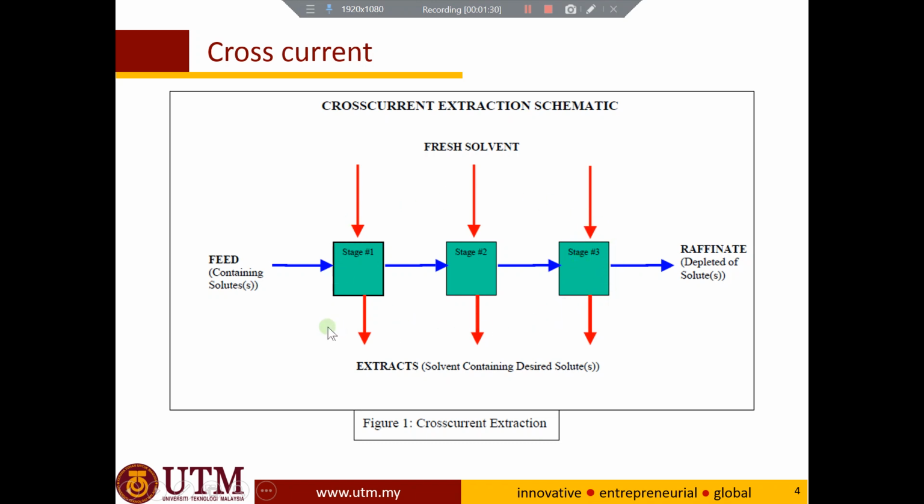And then what happens is the amount of extraction solvent will be increasing because you always add fresh solvent. Okay, so dia akan bertambah sebab you asyik tambah cecair baru je lah. Solvent maksudnya cecair baru, larutan baru. Okay, sampailah your sample is depleted of the concentration of analyte of interest.